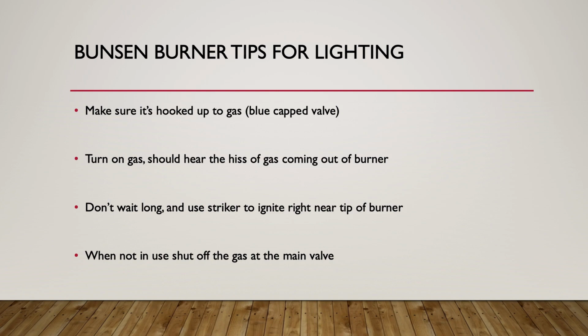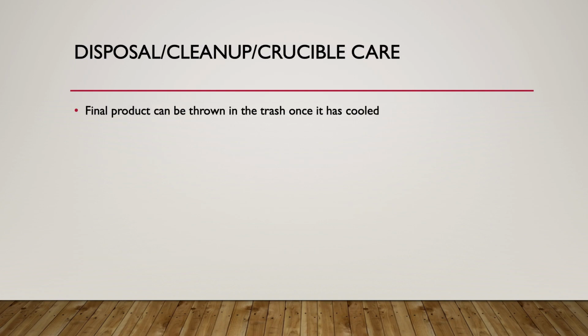And I'll have a complete visual demonstration here in just a moment of all these things. The last things I do want to highlight before I show that demonstration are general disposal, some cleanup, and some things about crucibles. Your final product, when you're done with this experiment, can just get thrown in the trash. Just make sure it's cooled down some.